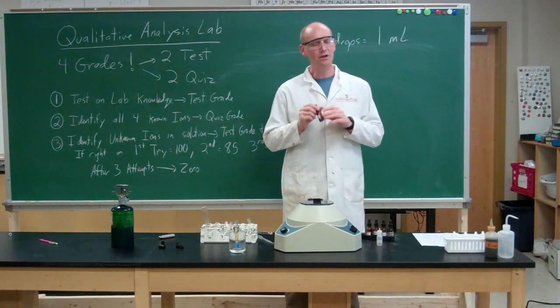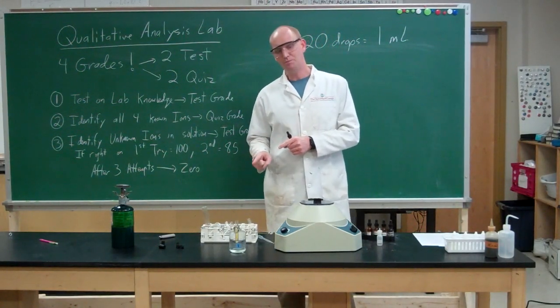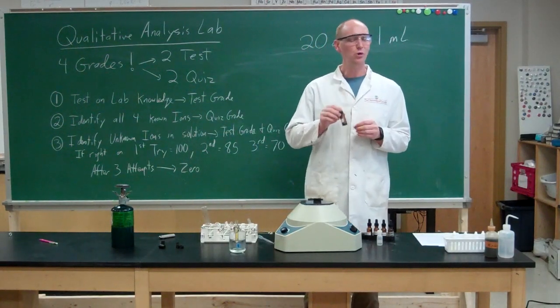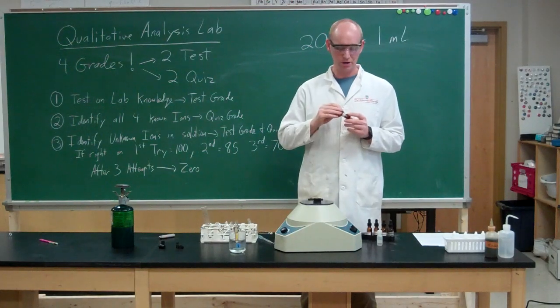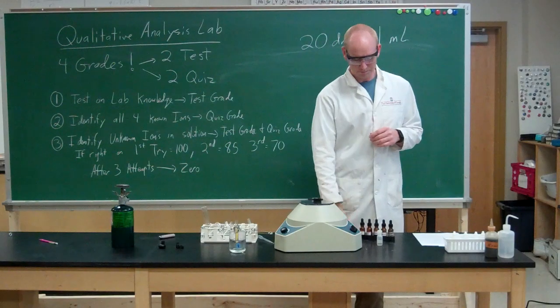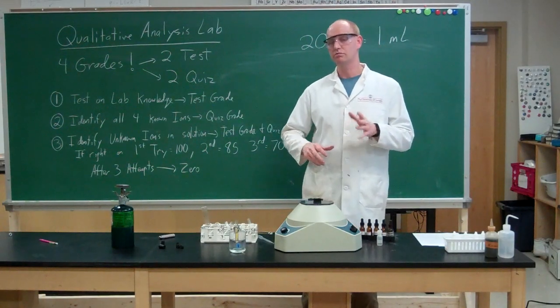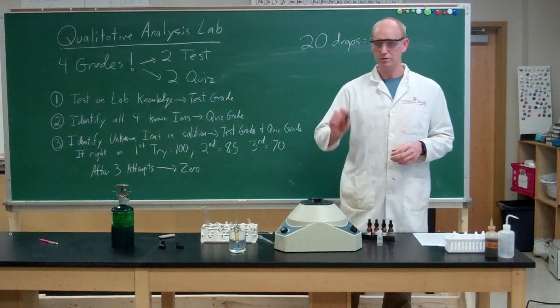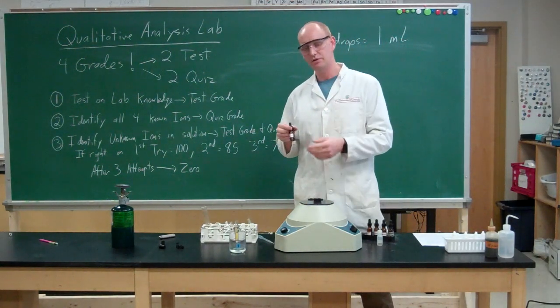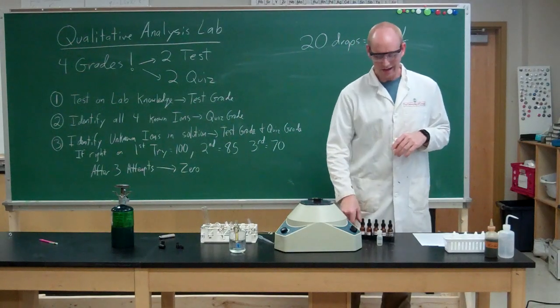Now, if you mess up the earlier part of the lab, and you don't form that chromate ion, you can have chromium, but chromium itself doesn't react with barium chloride. Only the chromate ion does. So make sure that you don't mess up earlier, so that you can get a solid. Now, you can centrifuge this, and you'll see a solid, and it has a certain color.